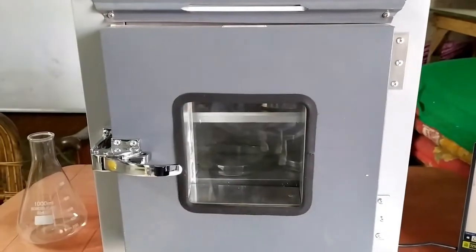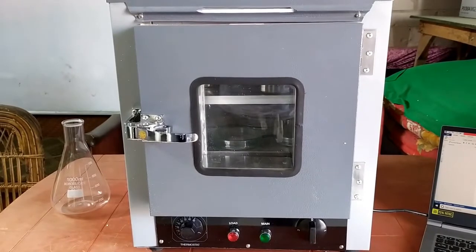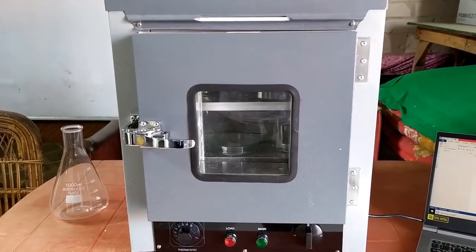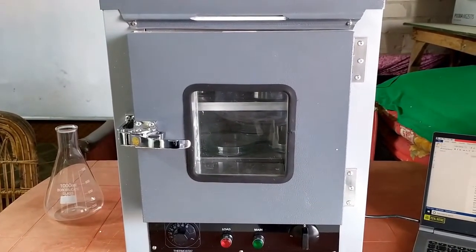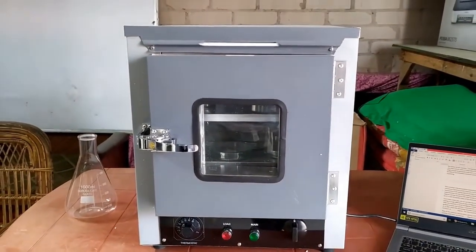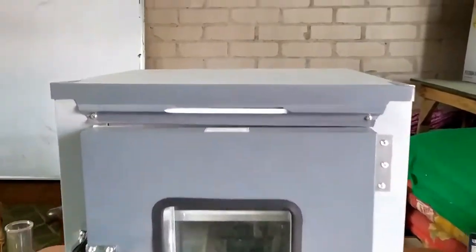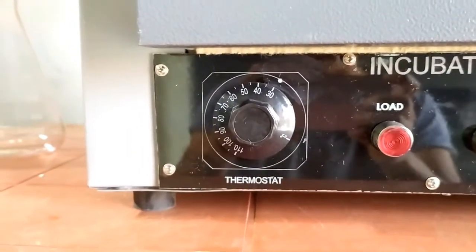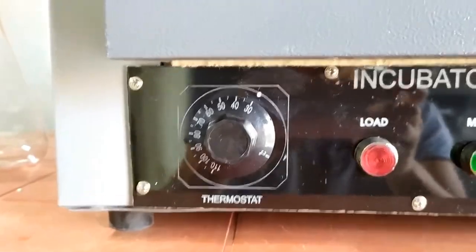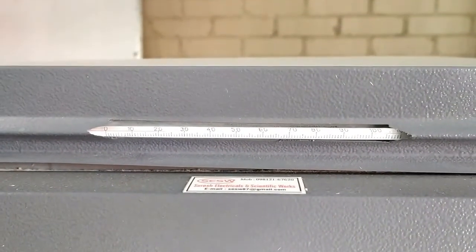Now, coming to the temperature sensitivity and accuracy of this 3500 rupees incubator. After the first 8 days of continuous operation of this machine, I've made certain observations. To begin with, the thermostat temperature knob setting doesn't exactly correspond to the real-time thermometer reading, and also it's not very responsive at lower temperatures. Also, the temperature readings for a particular setting vary every time I repeat the test.